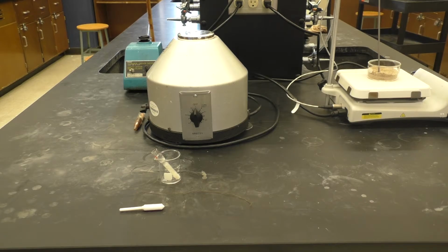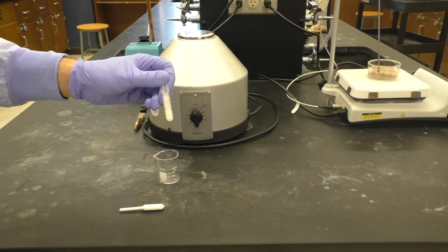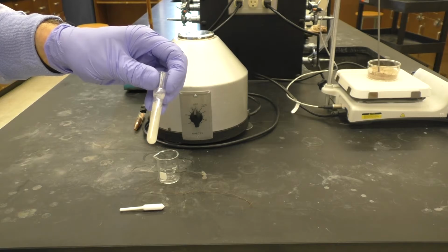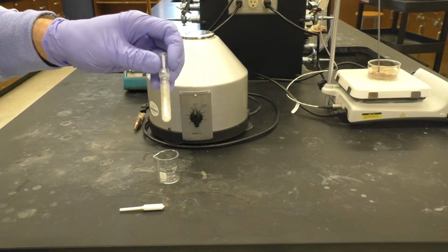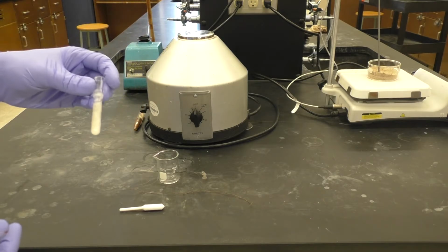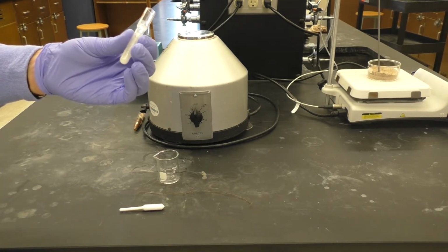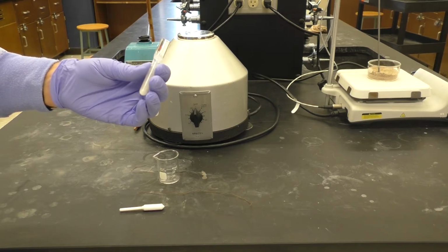So now that our material has crystallized, we need to be able to filter it to remove the solvent. Now this isn't very easy with a Craig tube, where it looks like we have a lot of crystals stuck in there. It's not going to be very easy to get the material out under conventional filtering methods. But thankfully there is a useful centrifuge method for removing the solvent from a Craig tube.